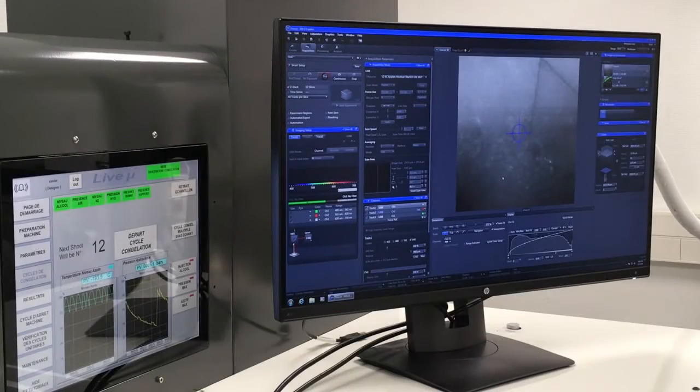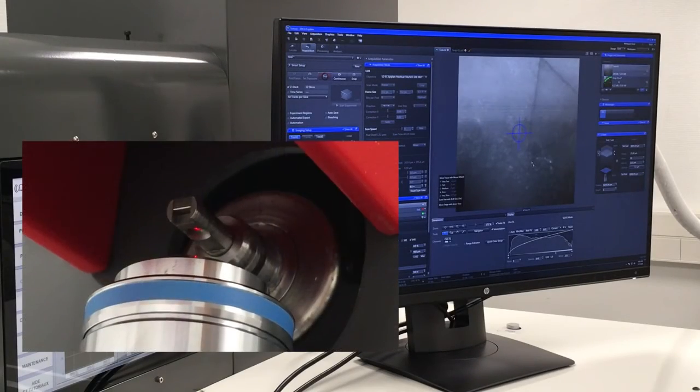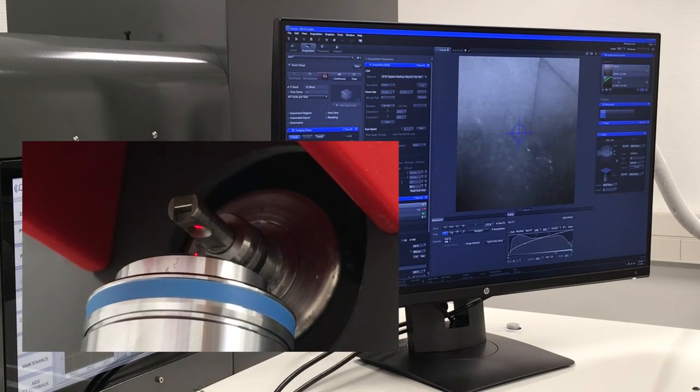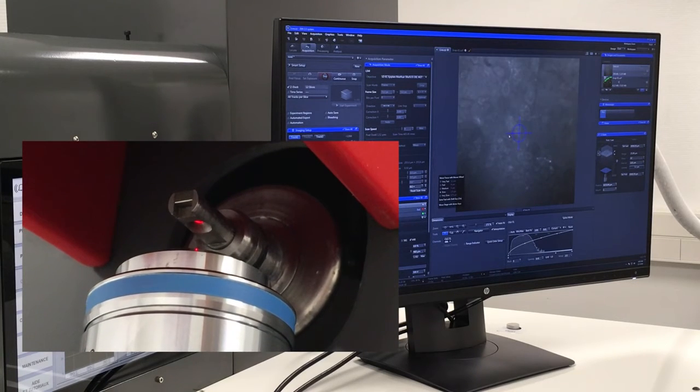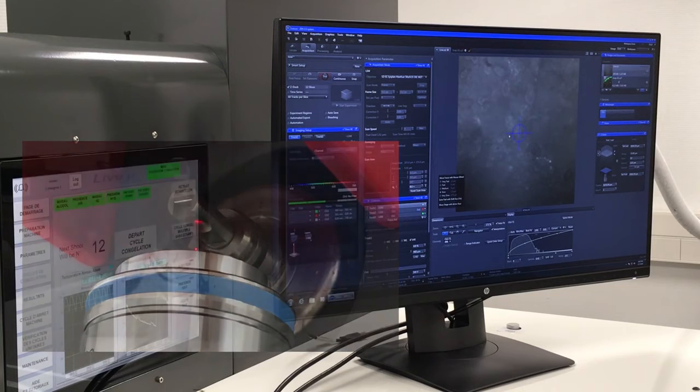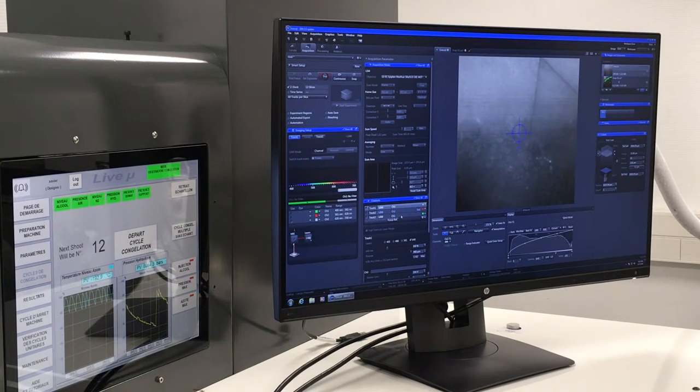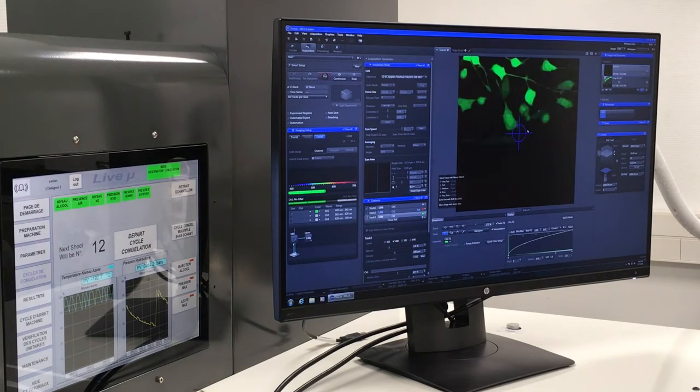After locating the cells and identifying the samples according to the carbon landmarks of the cryo-capsule, we can find the focus and start fluorescence imaging on the channel of interest.